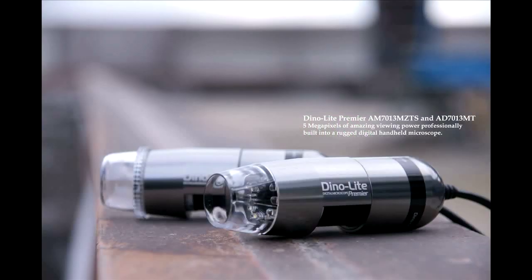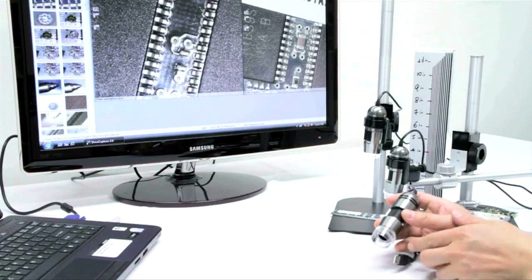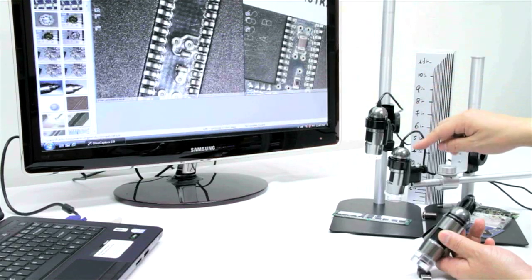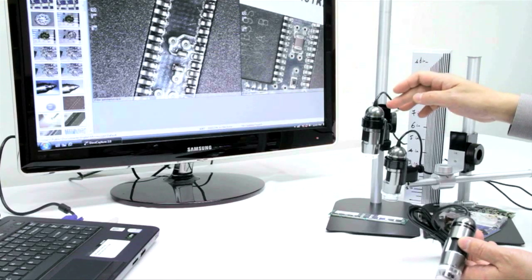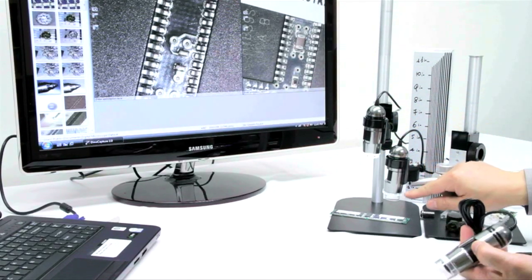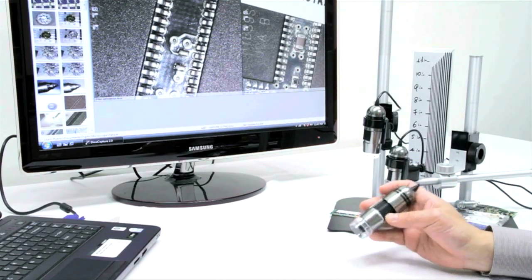Introducing the 7000 series of Dynolite Microscope. The 7000 series is the latest addition to the Dynolite Microscope family: the AD7013MT, the AD7013MTL, as well as the AM7013MZTS. The first model is our L series, which is a longer working distance model. The second is the ZTS, which features a polarization feature as well as 240 times magnification.